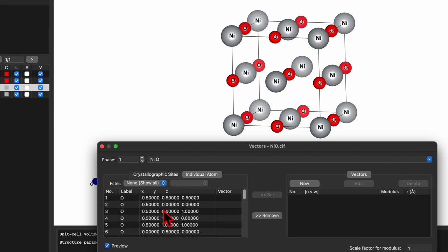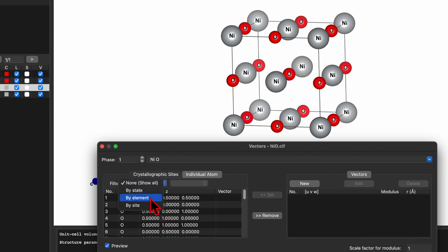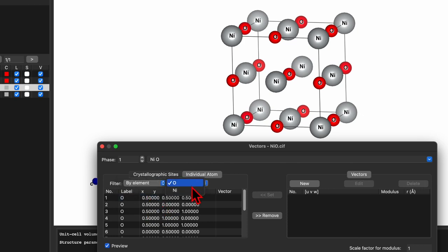The list will include both nickel and oxygen, so we have to apply a filter by element. Select the element and choose nickel, as I want to assign a spin or vector to this nickel atom.